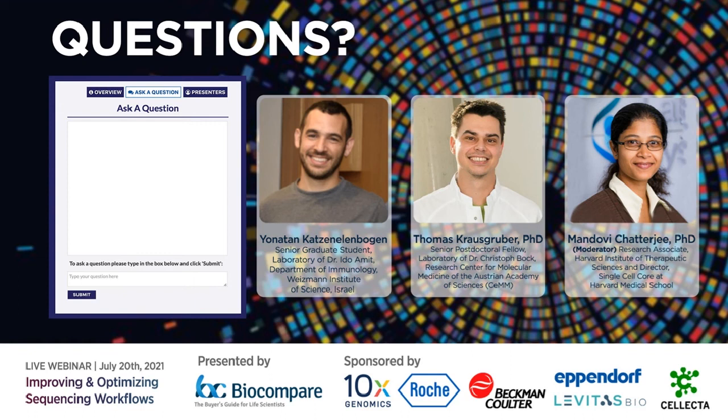Sure, and I think this is important to check. But for any of these technologies we talked about today, from the bioanalyzer or tape station traces, you can only say whether the library looks good or not. It rarely says how good your data would be, because in my experience, if a sample has low viability, you cannot really tell from the library prep, because the libraries often look quite good. But you don't know the answer until you get to the analysis part.